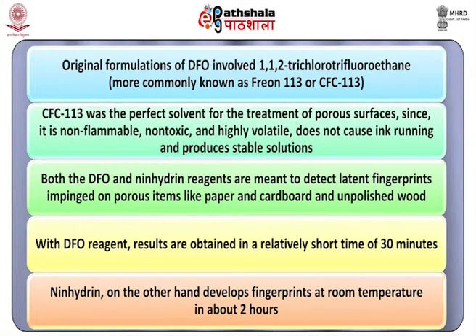Both the DFO and Ninhydrin reagents are meant to detect latent fingerprints impinged on porous items like paper and cardboard and unpolished wood. Lastly, we have learned that with DFO reagent, results are obtained in a relatively short time of 30 minutes. Ninhydrin, on the other hand, develops fingerprints at room temperature in about 2 hours.